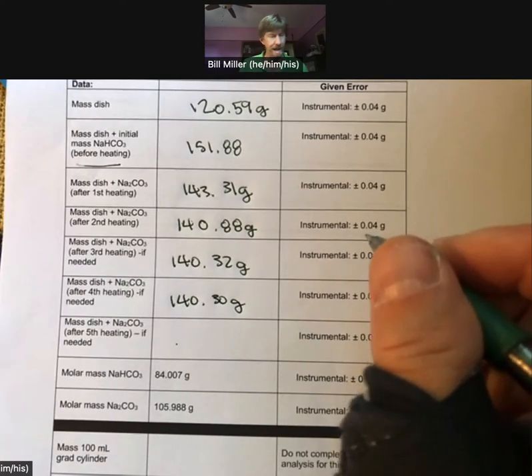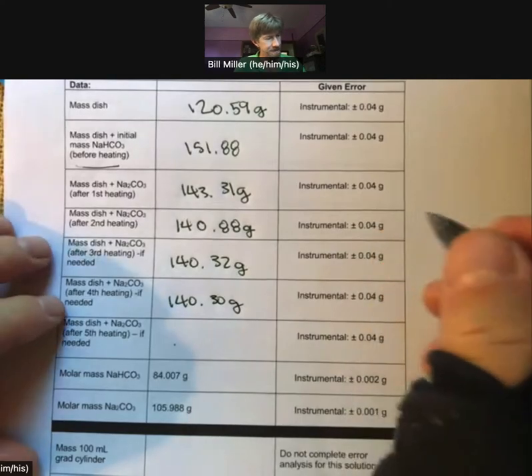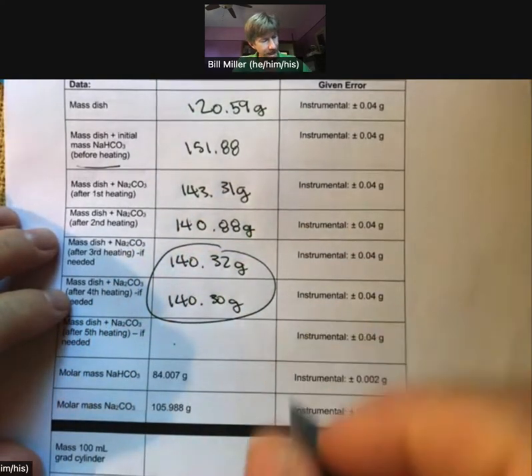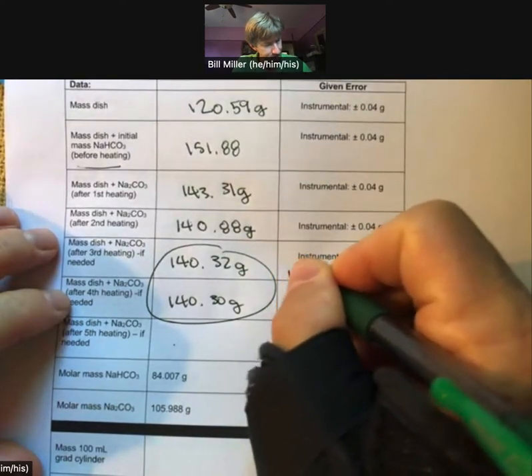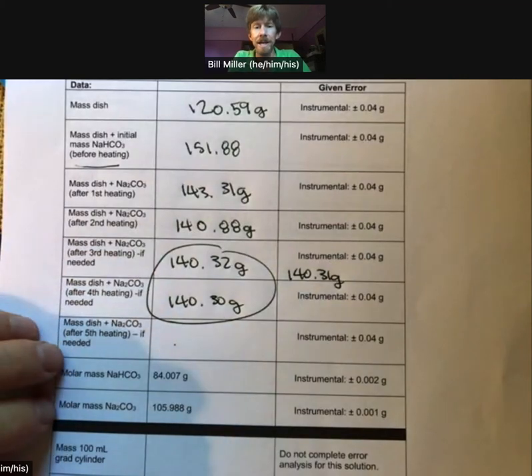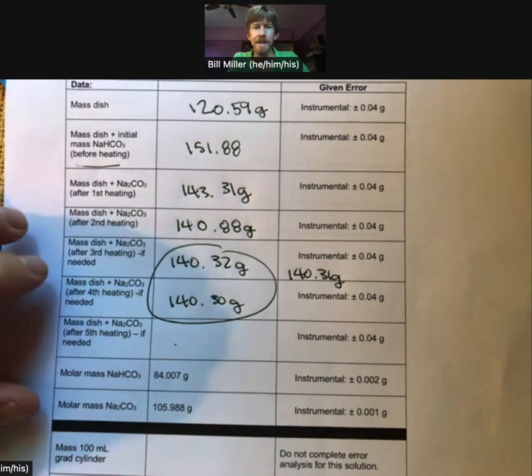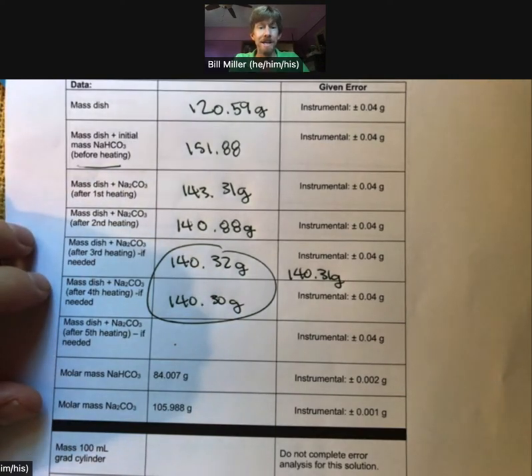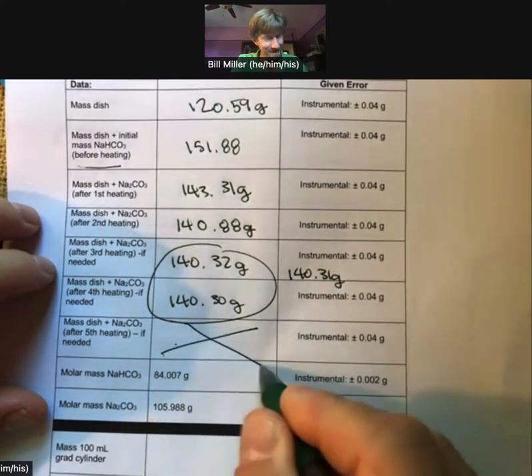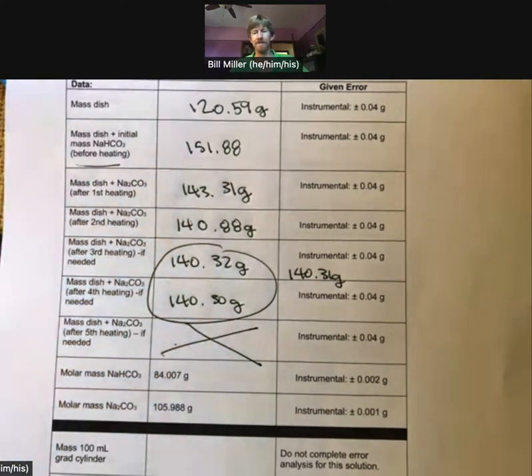We are now within plus or minus 0.05 grams. These are my final two values. I'm going to average them and use it as my final number moving forward. In the next one, we'll talk about how to do data analysis. I did not use this last one here, I'm happy to say. All right, more on data analysis coming up.